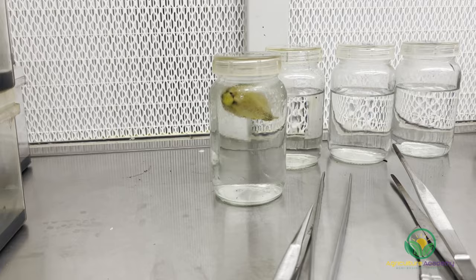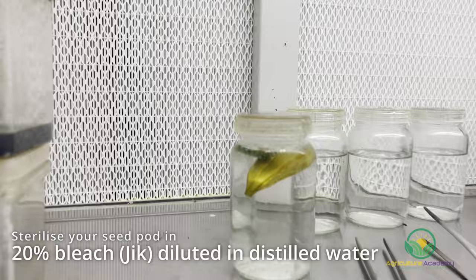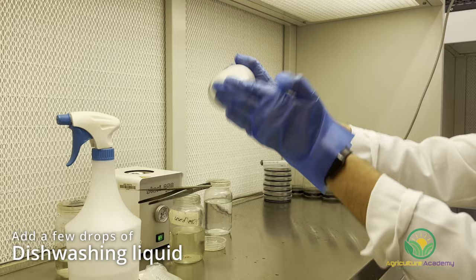Step 1 of seed flasking requires you to sterilize your seed pod. We placed our pod in a solution of 20% jik and distilled water, which was autoclaved along with the growing medium. A few drops of dishwashing liquid were added. The pod stayed in this solution for 30 minutes and was regularly shaken.